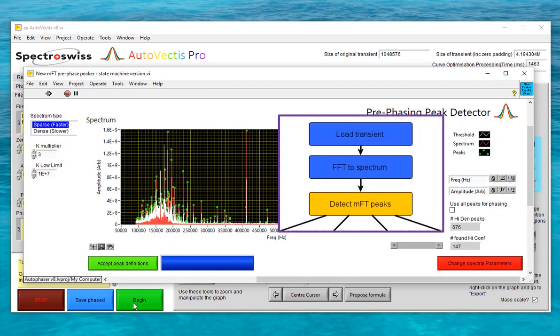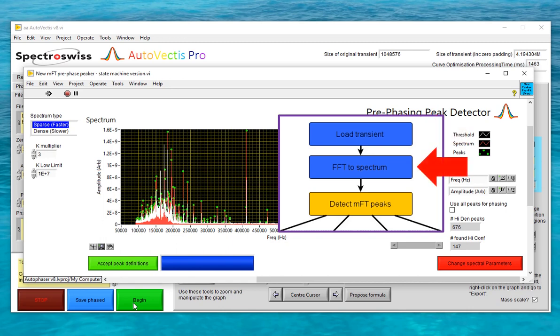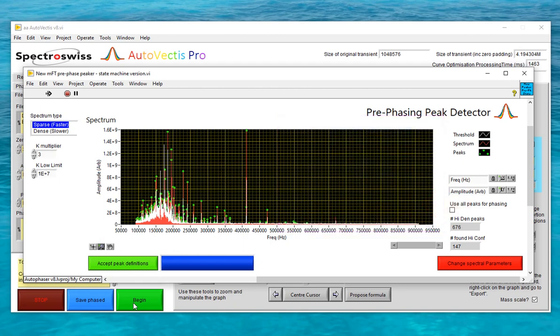When the begin button was clicked, Autovectus loaded the transient associated with the file we're processing, Fourier transformed it, and is now presenting the user with a magnitude mode spectrum to use to identify the peaks that will be used to optimize the phase correction function. Phase correction is a process a lot like mass recalibration in that you need a series of good peaks in order to be successful. On this screen the user can change how the peaks are defined, but Autovectus will attempt to identify the correct peaks to use for phasing.